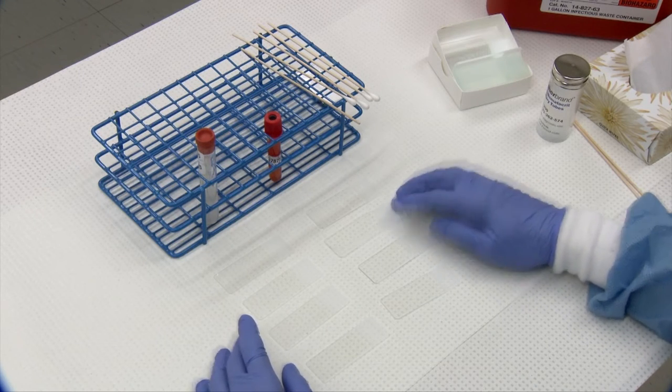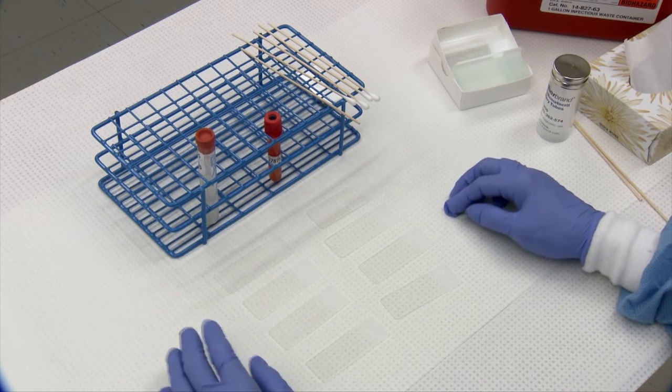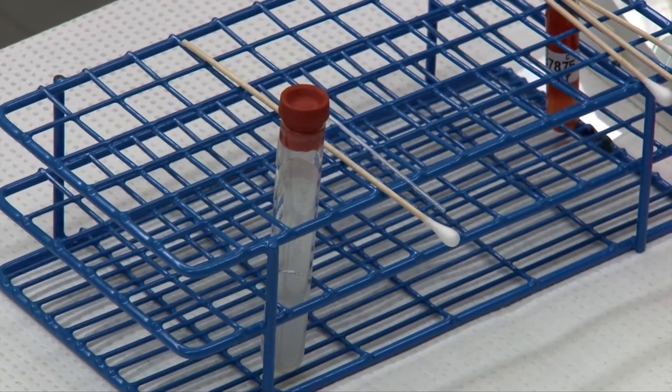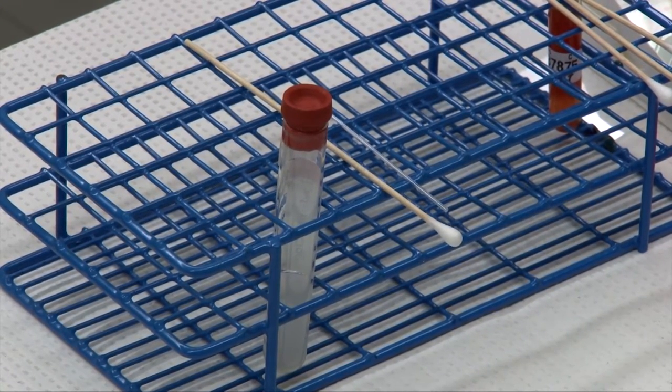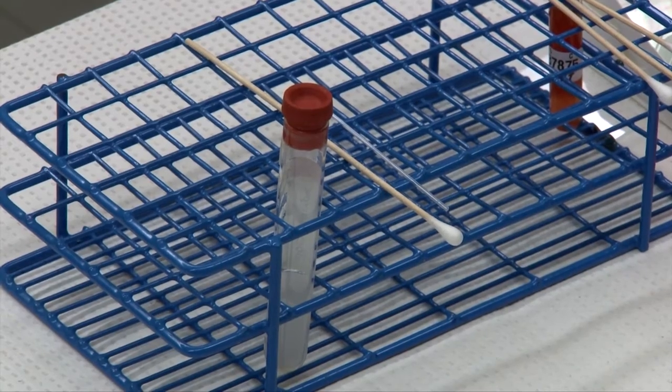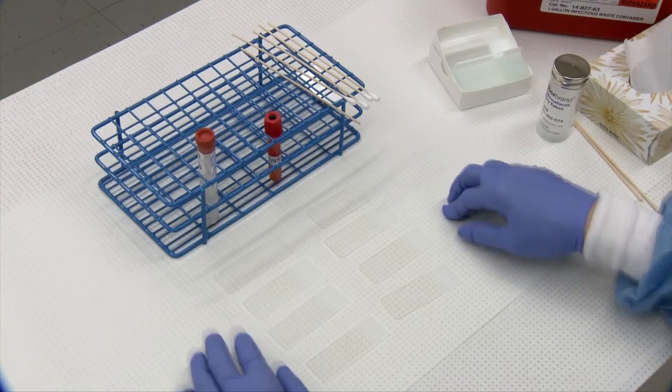Red counts you wouldn't want to attempt a manual count. After a fluid sample has been collected it's very important to make your smears as soon as possible to prevent the cells from disintegrating over time.